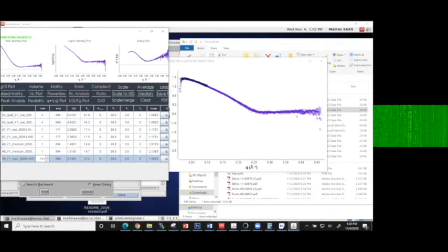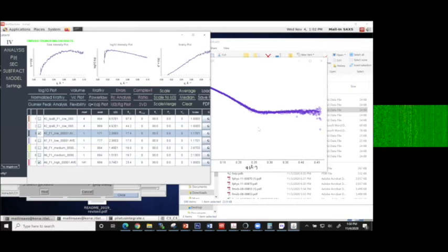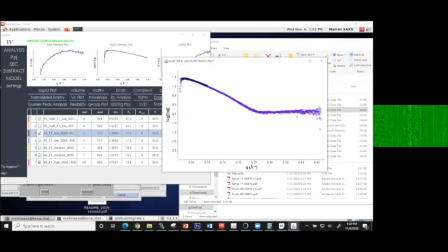So something like that. And again, you can change the colors, since Scatter does random colors, so you can change it to be red and black if you want. Sorry, I want this one black, just to make it clear. And of course, it didn't change the colors.